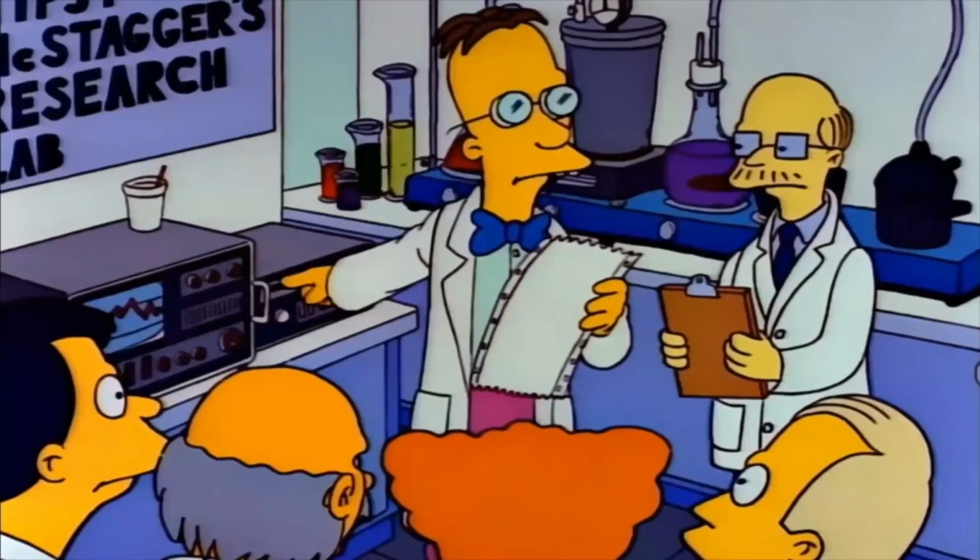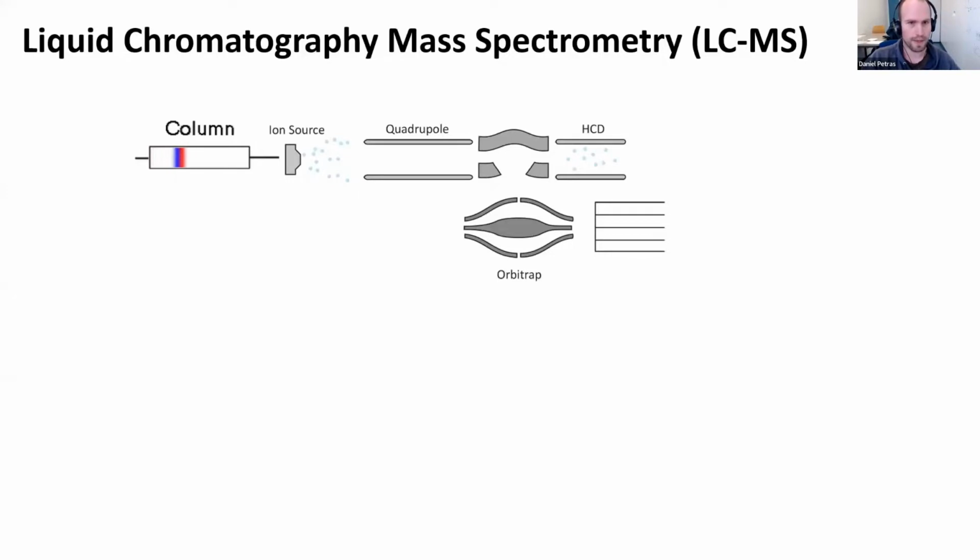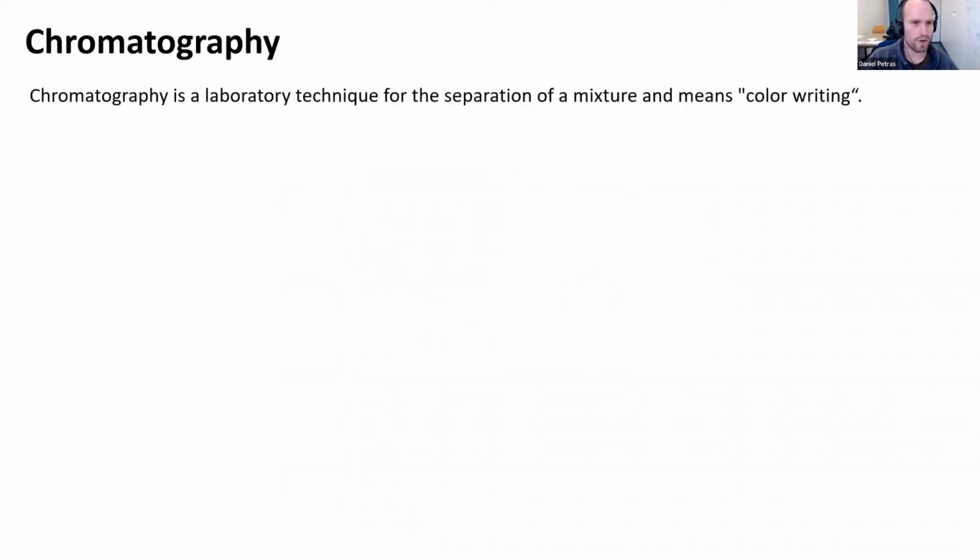So I think we had a comment before that we should maybe talk a little bit about fundamentals there too, and I just prepared a couple of slides to introduce you to chromatography really quick before we move on to hyphenating this to mass spectrometry. In this nice animation, you can see basically the idea is that we separate compounds over a column, could be an HPLC column, before we then move it on to the mass spec and then get a mass readout.